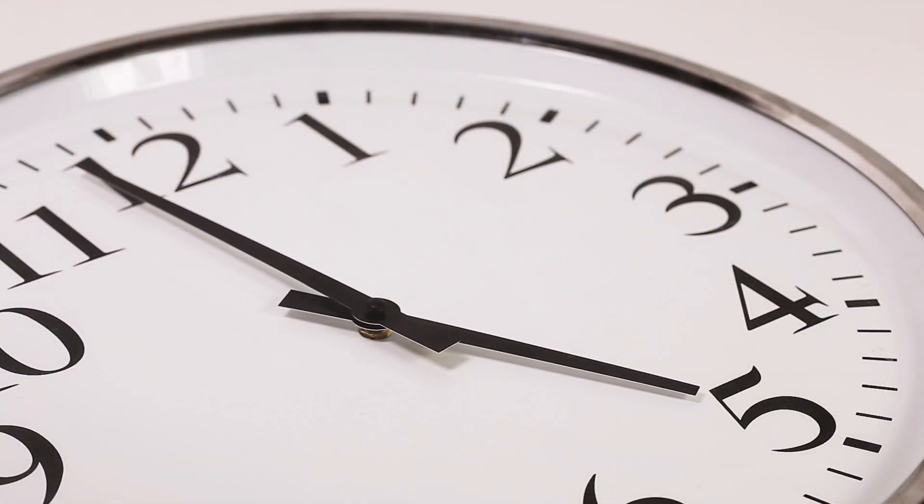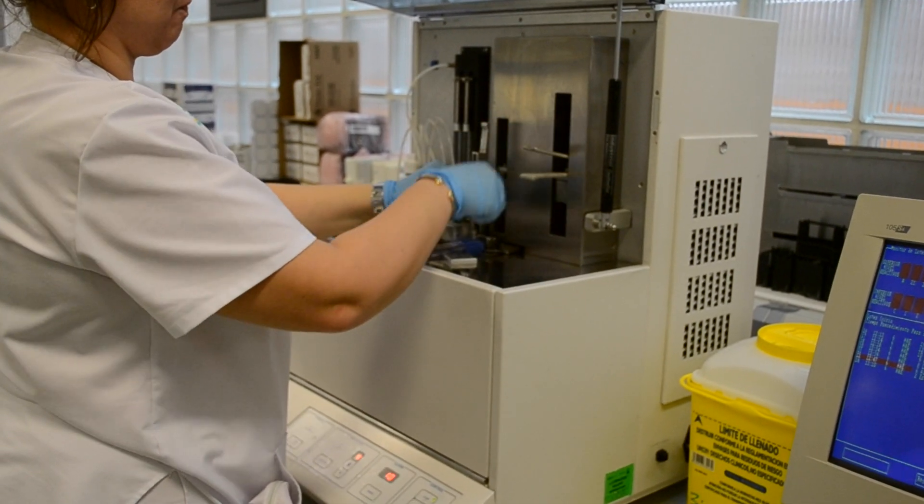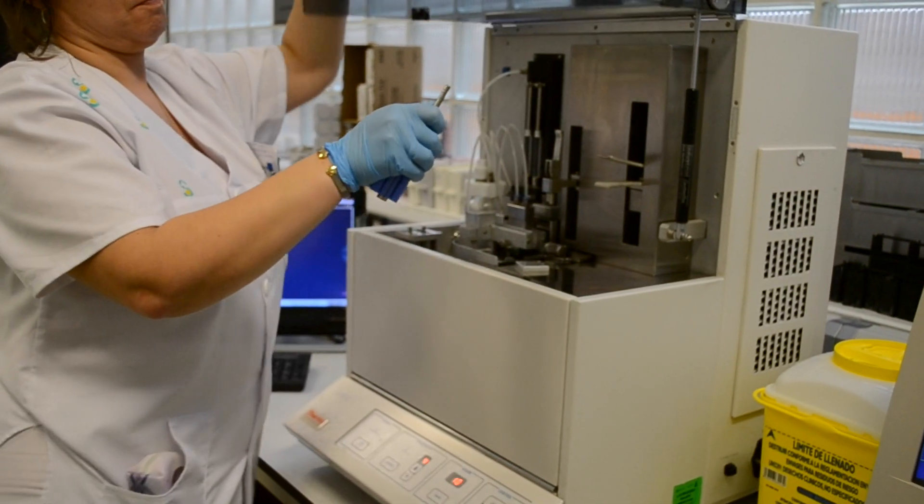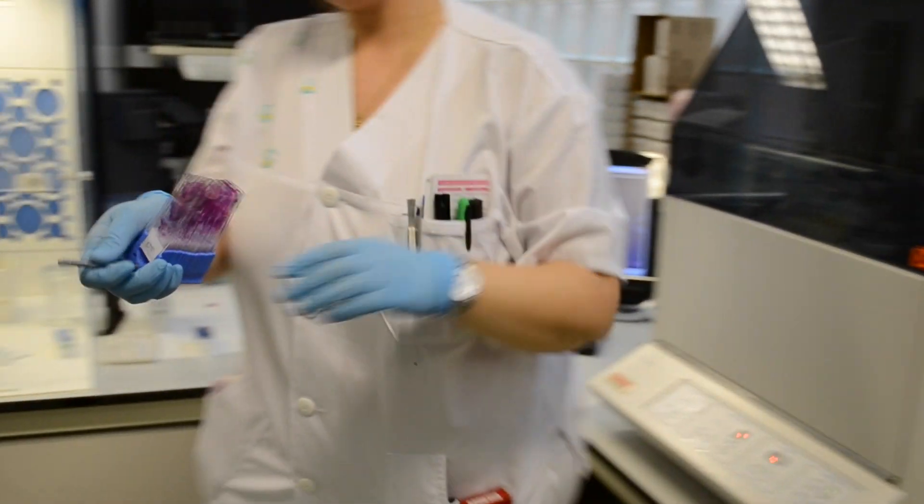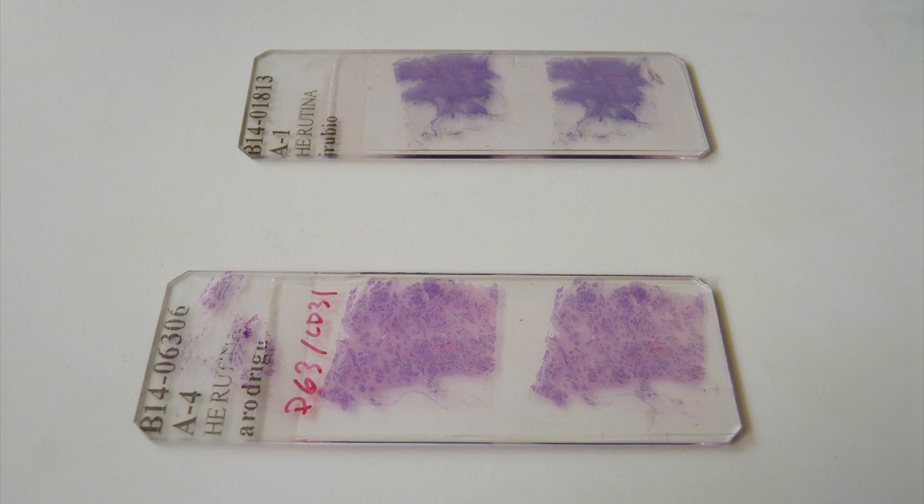Viewing with the microscope. After this, we have a stained histologic specimen sandwiched between a glass microscope slide and cover slip, ready to be mounted on the stage of a microscope for inspection and diagnosis by the pathologist.